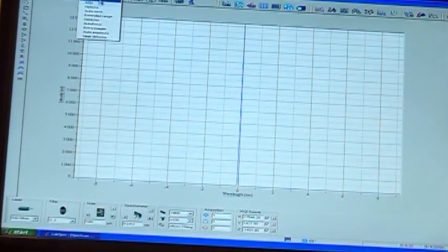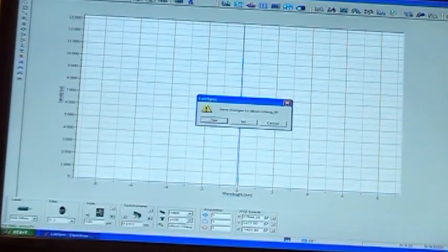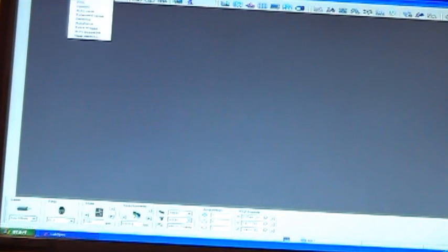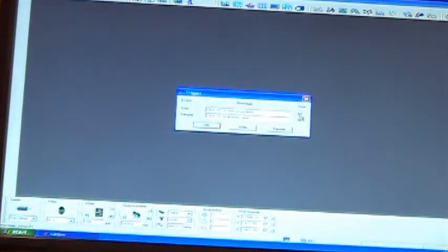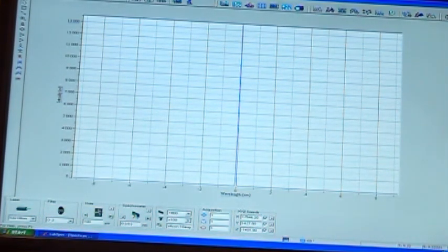Where if you have the trigger turned off, and you click on the piggy, oh, I guess I missed one. Hold on. Missed them both. I swore I turned them off. And I click on the piggy. It'll just go and it doesn't ask you if you want to start or not.